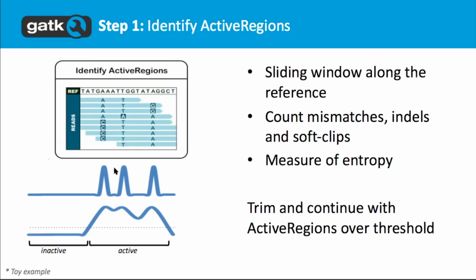Entropy is just, you know, the amount of chaos we have, the amount of things that are not orderly and neatly matching. And we can take that as essentially a function. We apply some smoothing, and on top of that, we measure, it's basically a local optimization problem where we look to see if we have any local peaks.